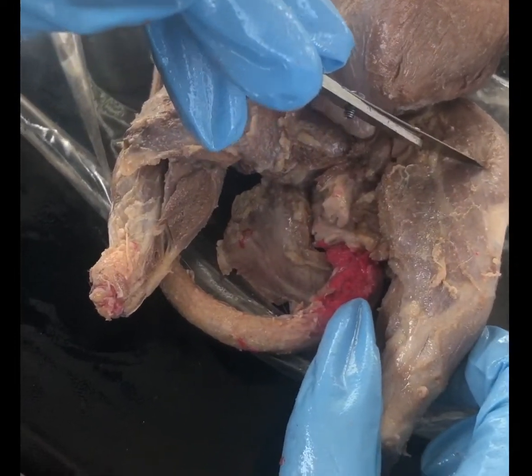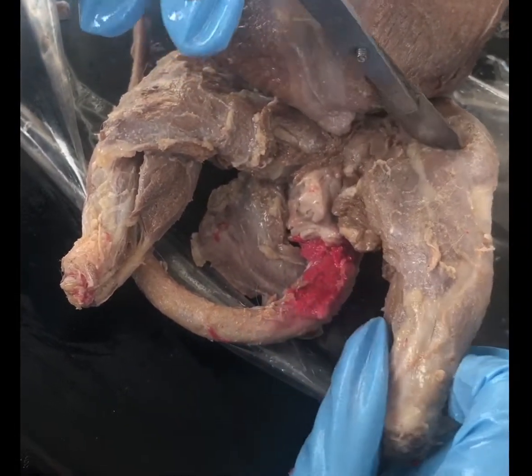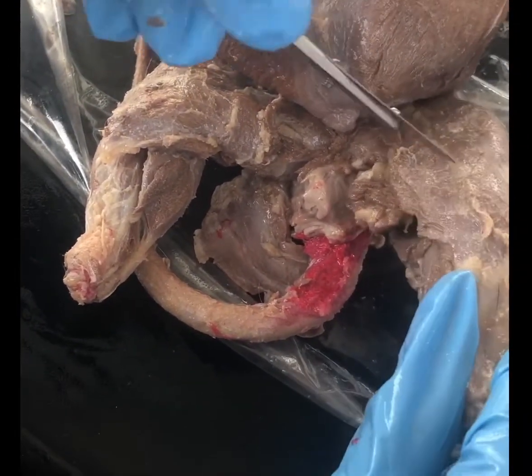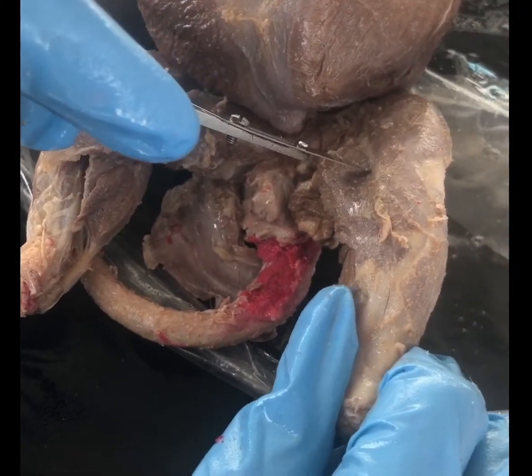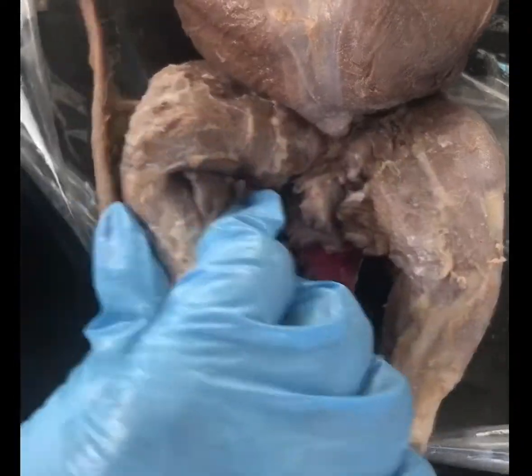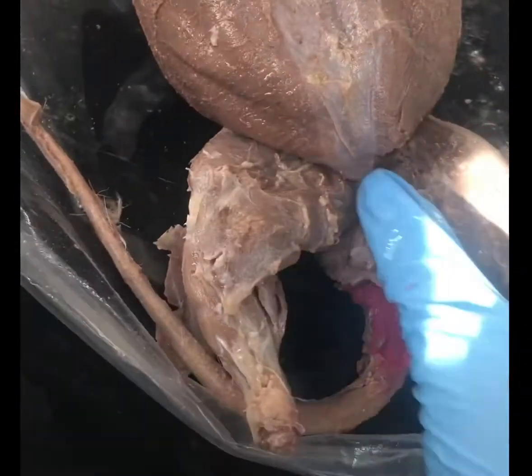The iliopsoas flexes the thigh. It's right under this one on the inside. And then the rectus femoris extends the leg. So it's literally the center muscle that you would find at the thigh. So it would be at the center of the thigh, or like right here.